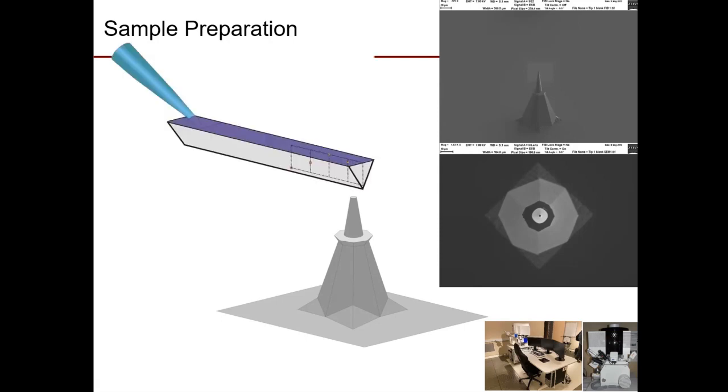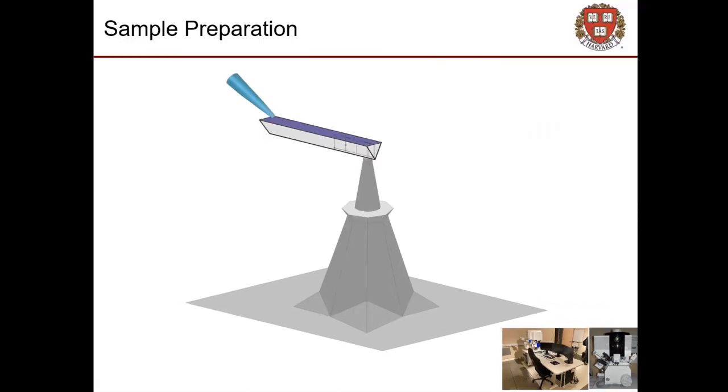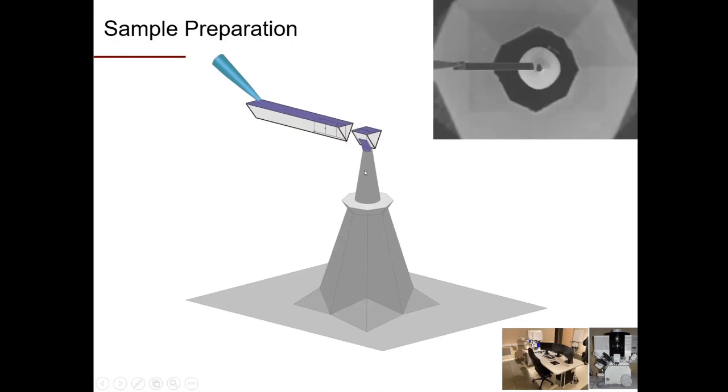We bring, with the micromanipulator needle in the FIB, our bar of material over to the top of one of these posts, land it on top of them, and then glue it with a little patch of our FIB deposition material. We can then cut right next to that patch, freeing both the attached piece, which is stuck to the post, and the bar itself, which can then be taken to the next post in the row of posts, and we can make more and more and more atom probe tips from one lift out, which is very efficient.